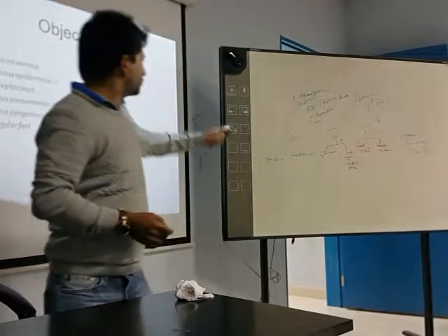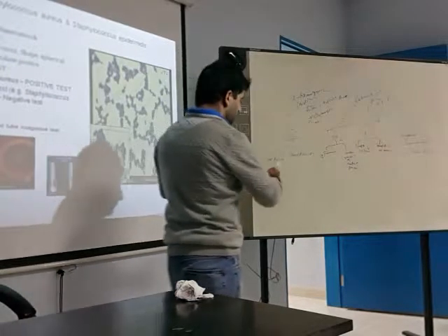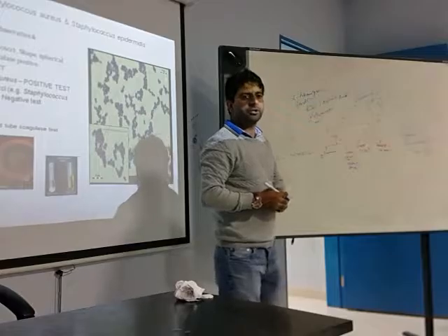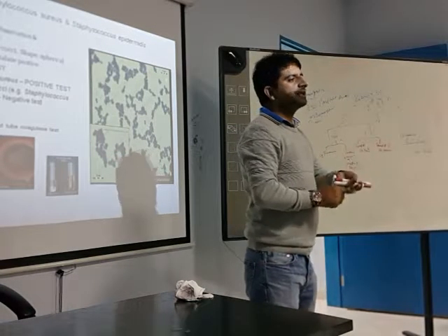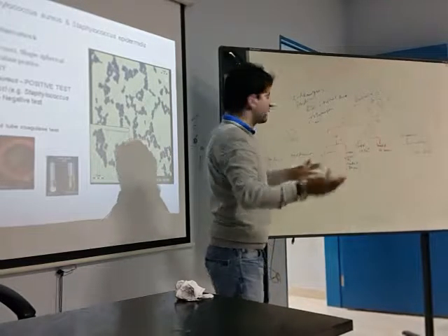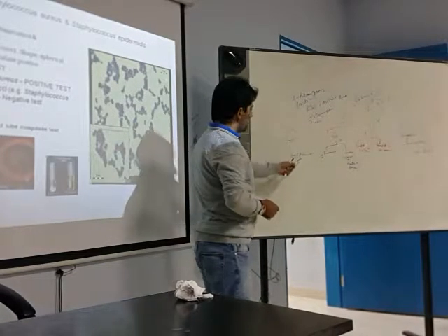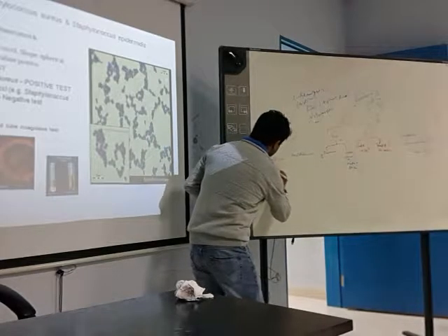So first we go to Staphylococcus aureus. When we go for the examination in the laboratory, either the gram stain or the culture, we find different characteristics of microbes belonging to the same family. First, if we look at Staphylococcus aureus and Staph epidermidis, both of them are catalase positive.